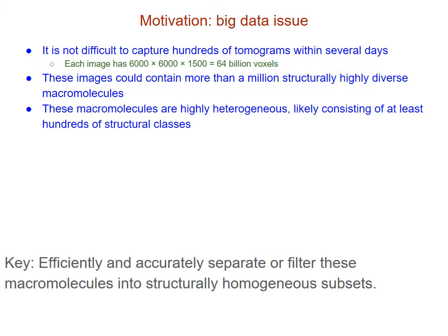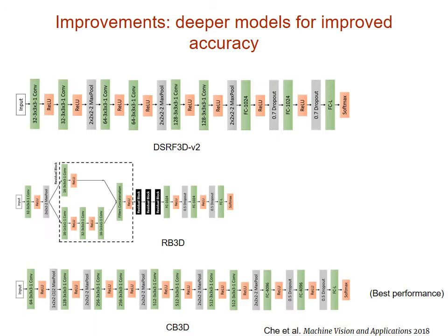Therefore, it is very important to develop methods to efficiently and accurately separate or filter these millions of macromolecules into structurally homogeneous subsets.